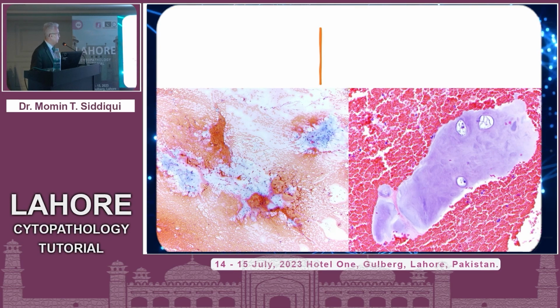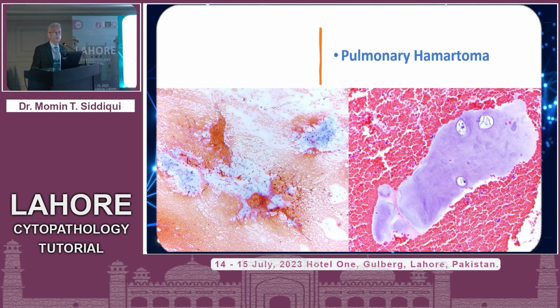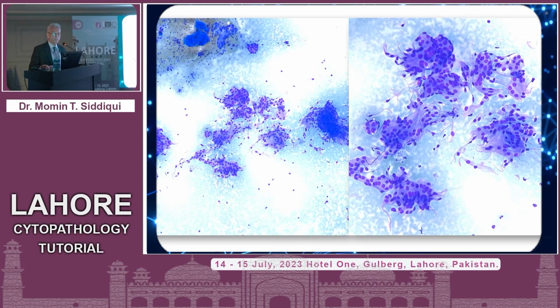So when you have all three elements of your aspirate, DiffQuick, pap stained, and then the cell block, you can easily make a diagnosis of pulmonary hamartoma. Commonly, it can be missed sometimes, but when it's there, you should be able to make an easy call. This is another interesting case, highly unusual in this location. Any takers for an outright call?